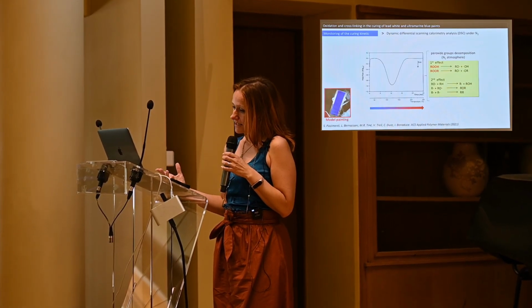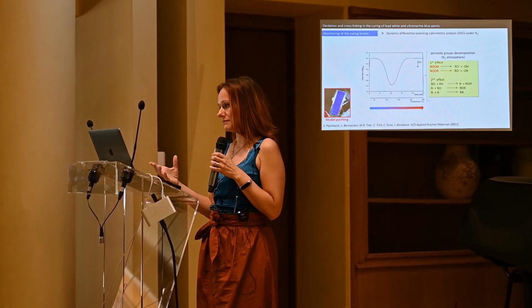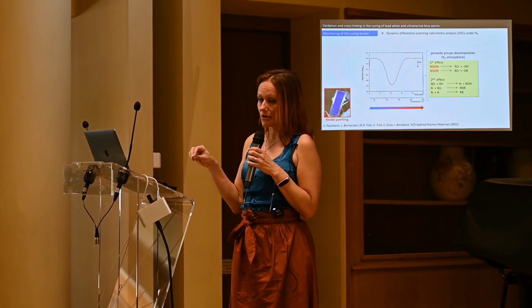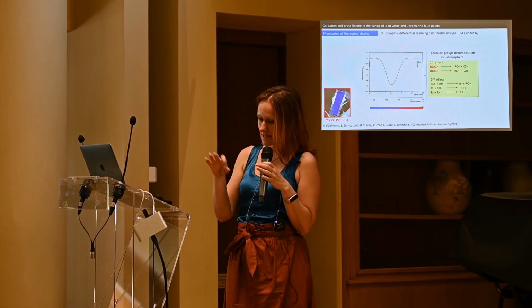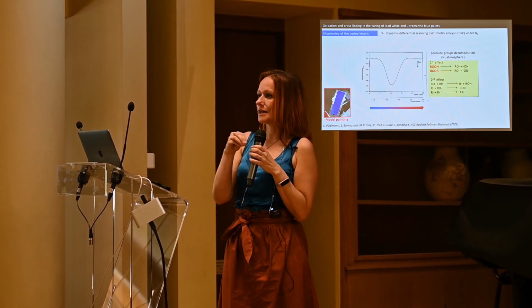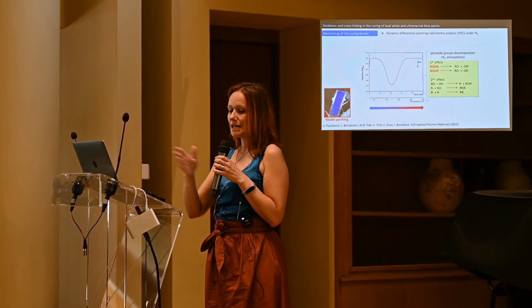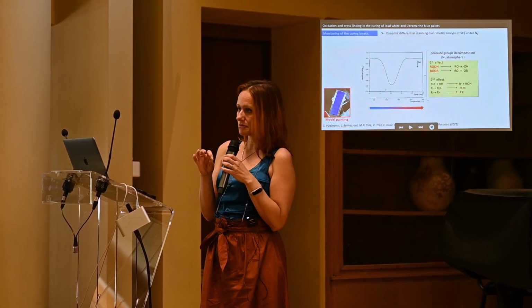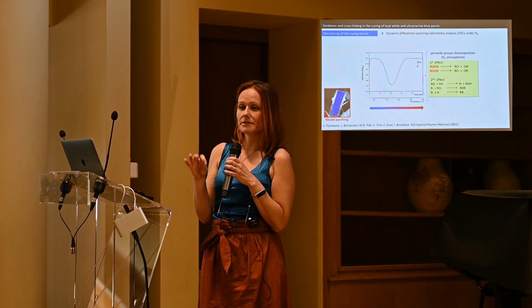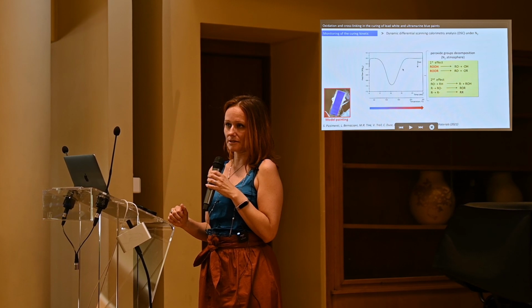The thing is that we wanted to try to understand this more, so we used differential scanning calorimetry under nitrogen flow, so in inert atmosphere. What we do is take samples from the paint layers and analyze them, at the beginning daily, and then every few days, and so on, in time. The sample is placed in a platinum crucible and heated up in inert atmosphere, and you see that a peak like this is formed.